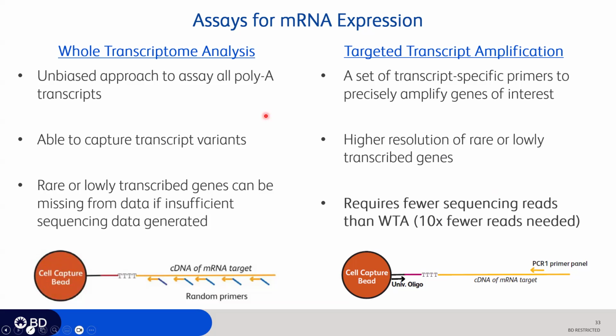And this is generated via random priming and extension. We also have our targeted transcript amplification approach. So here, this is a great assay in that it is very sensitive. Here we're using transcript-specific primers to target genes of interest.